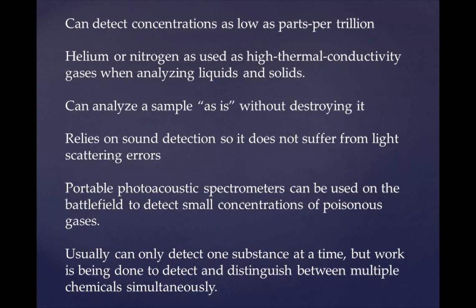In the case of analyzing liquids and solids, the sample chamber is filled with a high thermal conductivity gas such as helium or nitrogen. Probably one of the largest advantages of this spectroscopy is that it can analyze a sample without dissolving or disrupting the sample in any way. The sample can be placed in the sample cells that already exist. Photoacoustic spectroscopy has a large advantage over other methods of producing spectra for solids because other techniques suffer from light scattering and reflection.